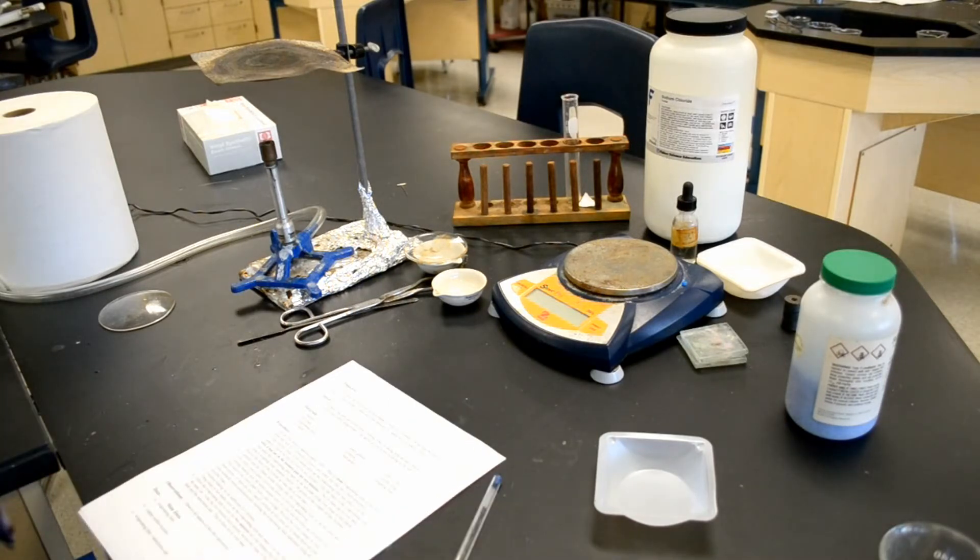The materials used in this lab include a balance, a hot plate, or in this case a Bunsen burner, an evaporating dish, hot hands, safety glasses, a scrupula, watch glass, copper sulfate X hydrate, crucible tongs, and a weighing bolt.